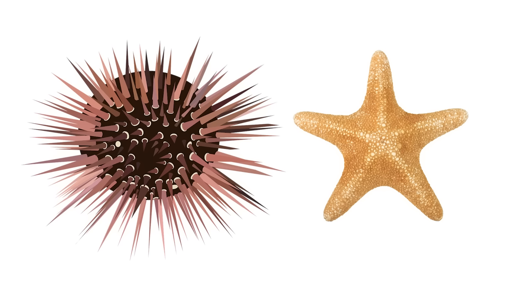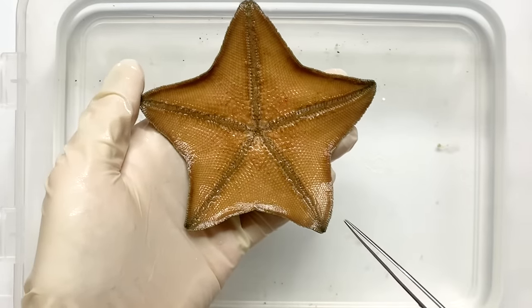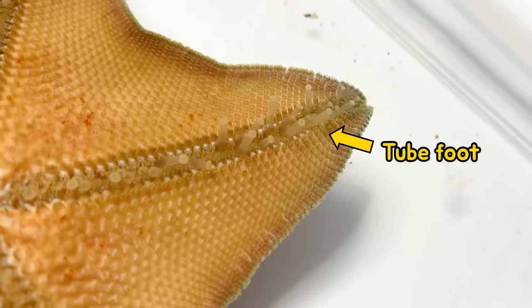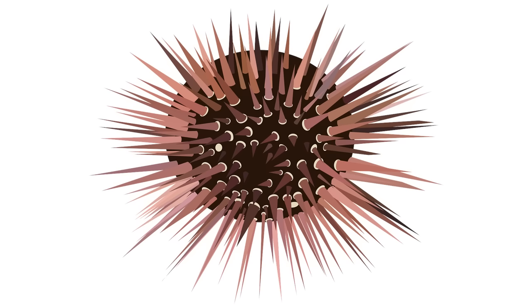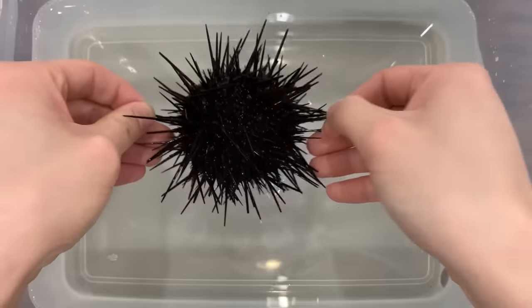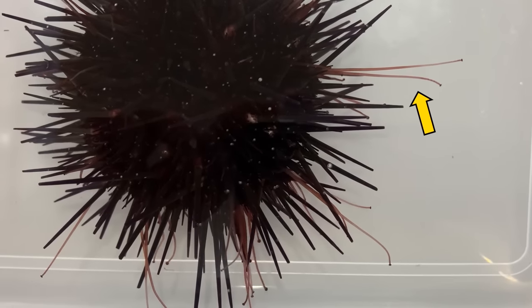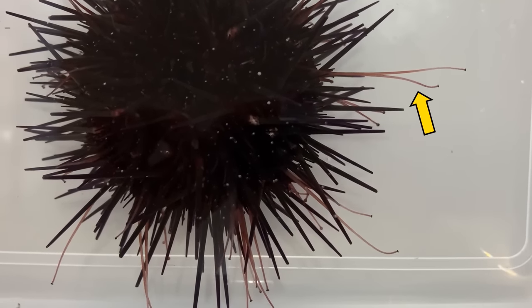Let's see what starfish and sea urchins have in common. Starfish have tentacle-like tube feet along 5 ambulacral zones on the underside. Sea urchins are thought to have only spines, but they also have tube feet along 5 lobes like starfish. If you put a sea urchin in water, you can see tentacle-like tube feet coming out — pretty long, isn't it?